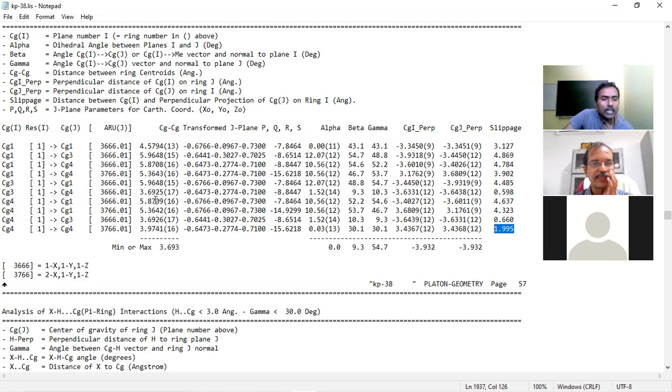4, and then we can come to this CG3, CG4 that must be analyzed. That may be significant, and there's only one. And CG4 also we can see, because with the CG4 ring, there are two interactions. If CG3 and CG4 is true, and again we need to neglect the CG4 interaction, because one ring cannot interact with one side with the CG3 and other side with the CG4. Therefore, in that case, we can neglect the CG4 interactions if the CG4 and CG3 is significant.